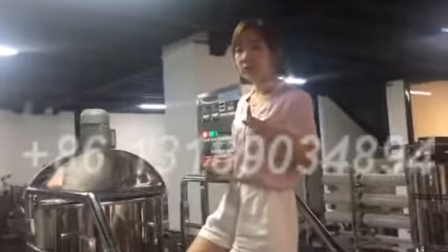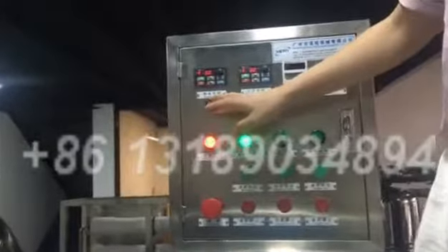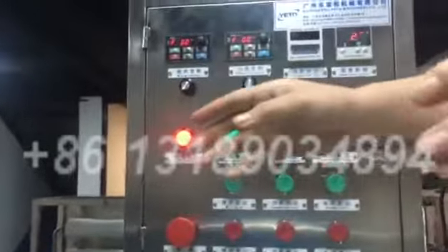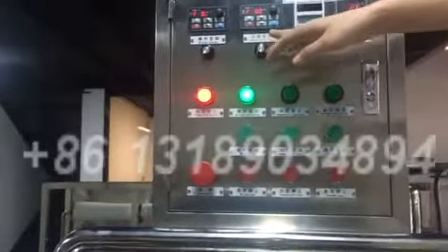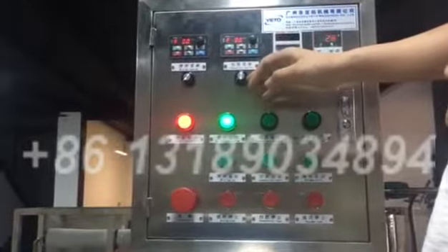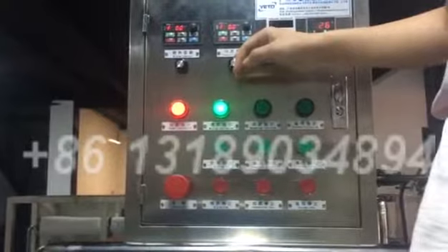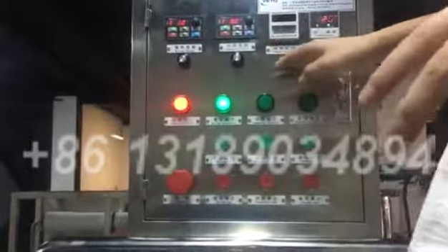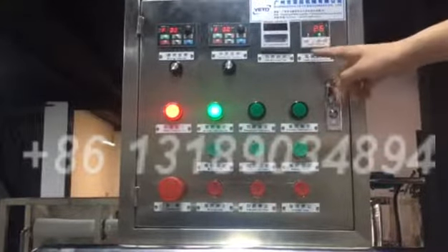This is the 200 single layer mixer from the mixer tank. Here is the mixing inverter — the speed can be changed from 0 to 63. Here is the homogenizer inverter — the speed can be changed from 0 to 2880. And here is the homogenizer time; it can be set in the window.